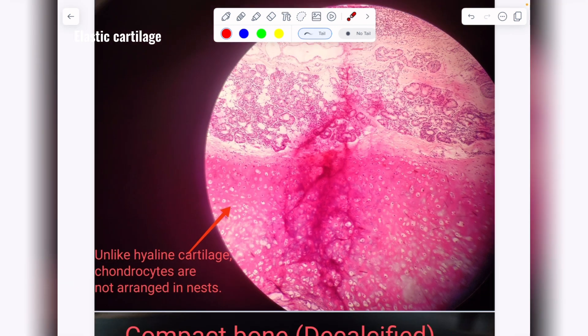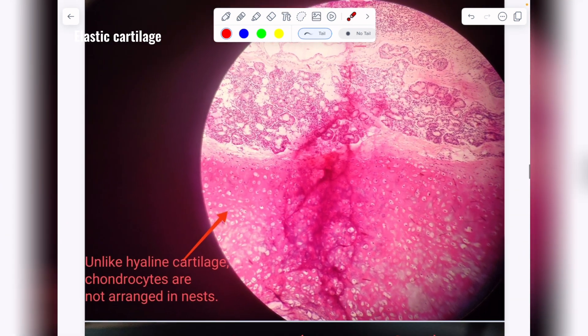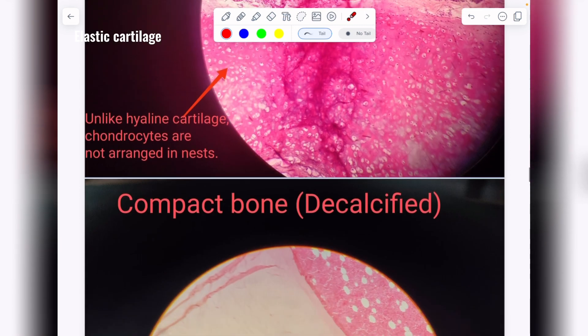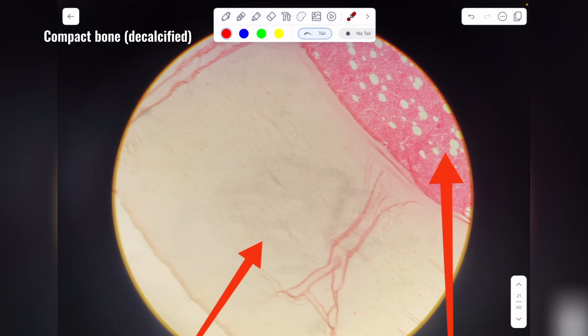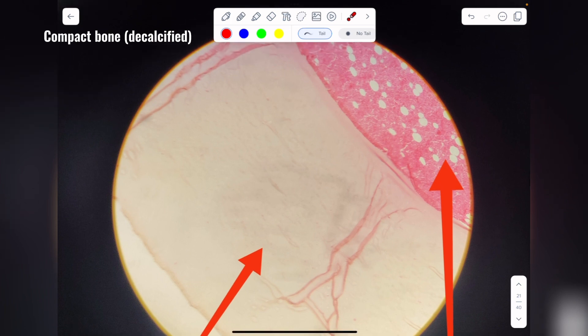To summarize the three types of cartilage: hyaline cartilage has chondrocytes in nests with a clear matrix; fibrous cartilage has high deposition of white fibers with chondrocytes in a chain or streak; and elastic cartilage has chondrocytes present individually in lacunae with an opaque matrix due to deposition of yellow fibers.